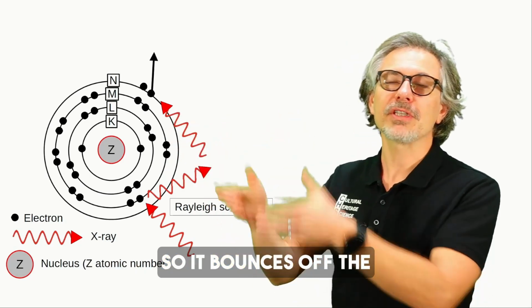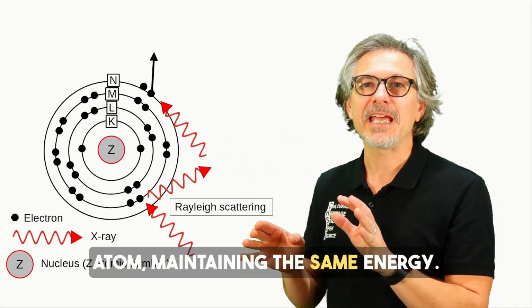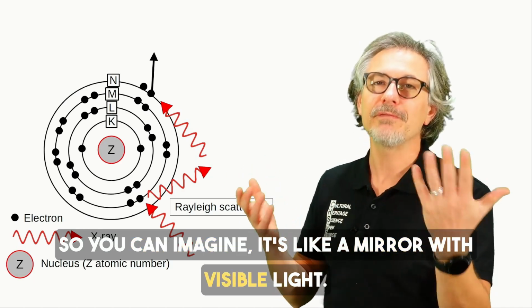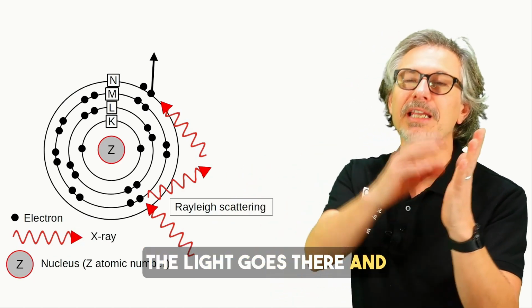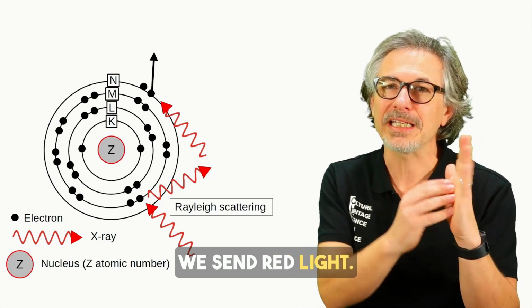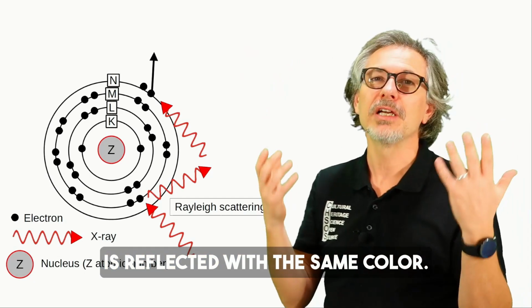So it bounces off the atom, maintaining the same energy. You can imagine it's like a mirror with visible light. The light goes there and maintains its energy, its color. We send red light, and from a mirror the light is reflected with the same color.